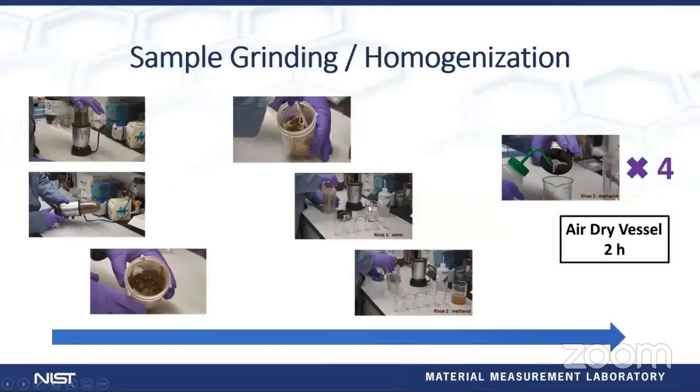But then we also had to come up with a procedure for cleaning the vessels, which involves using water for a rinse, then methanol for a subsequent rinse. After you do it 4 times with methanol, you can let it air dry, and 2 hours later, it's good to go. Now, we've used these probably for about 50 to 70 samples, so we haven't had any issues by using methanol so far for cleaning.